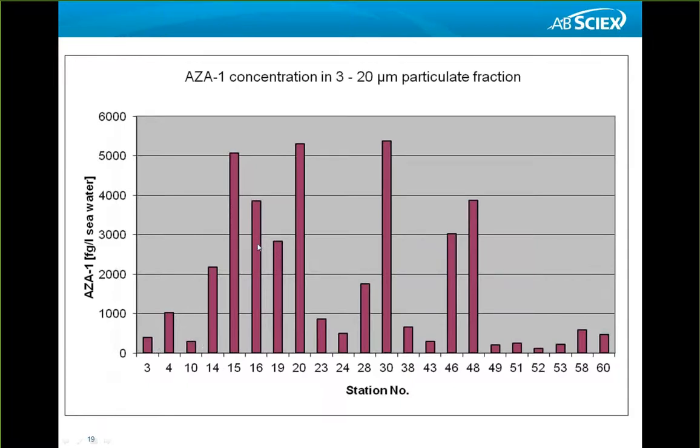And you see it's quite interesting that the pattern is changing, where some stations are completely free of this compound, as I said, based on the environmental conditions, and some stations are having very high levels. And I think it's obvious that at those concentrations in the water, in the phytoplankton, the shellfish production should be warned in order to prevent azaspiracids accumulating in the mussels, and later, of course, when we would consume those mussels, we may have a kind of toxic effect, or at least an unwanted effect on the humans or animals eating those mussels.